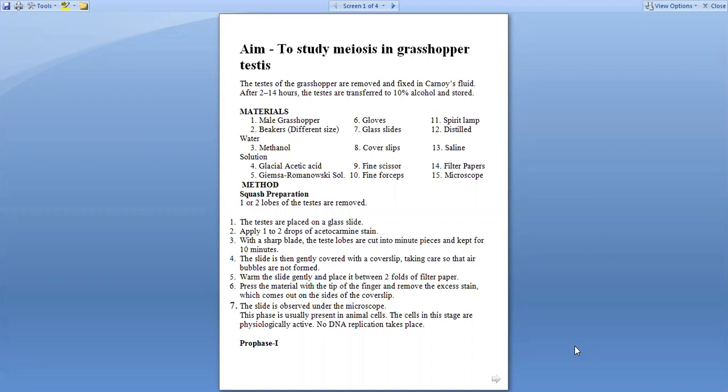What are the materials required? A male grasshopper, beakers, methanol, acetic acid, Giemsa-Romanovsky solution, slides, glass slides, cover slips, fine scissors and fine forceps, spirit lamp, distilled water, saline solution, filter paper, and microscope.